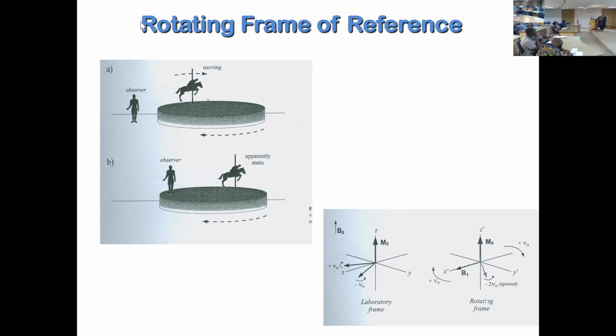You know, in proton NMR, you get ppm, parts per million. When you multiply this chemical shift value with the frequency of your spectrometer, you get hertz.